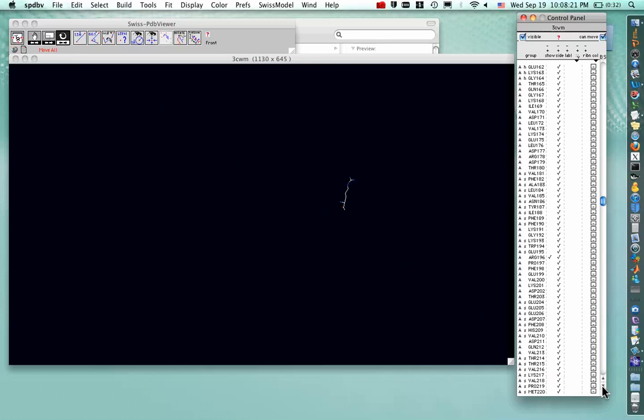Next we need lysine 243. There we go. And arginine 281 again.